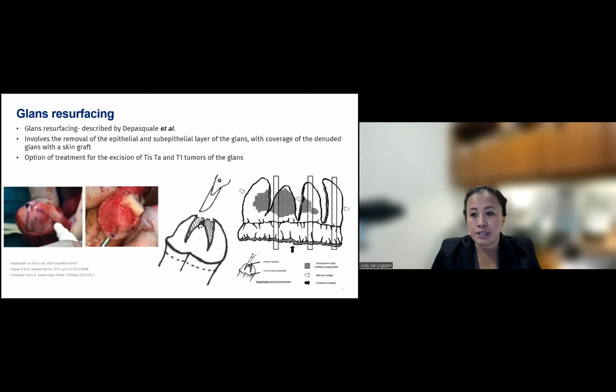Finally, coming to the penectomy specimen, which can be partial or total. For any specimen, we identify the specimen, take measurements, and identify the parts of the organ that were received. Does that include the glans? If there is a foreskin, note the presence of the foreskin and describe it.